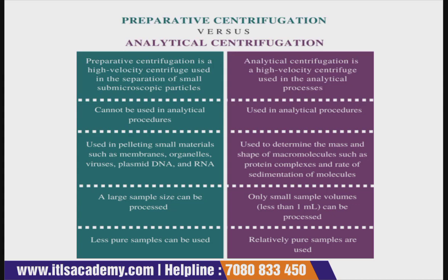So these are certain differences that can be asked in the interview. They can be asked whenever you are giving any exams. What are the basic differences between preparative centrifuge and analytical centrifuge? So these are certain basic differences depending upon the sample. For example, preparative uses less pure samples, and whenever it's analytical, they use pure samples.